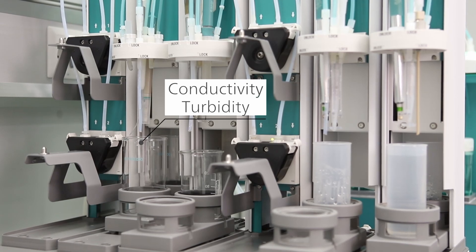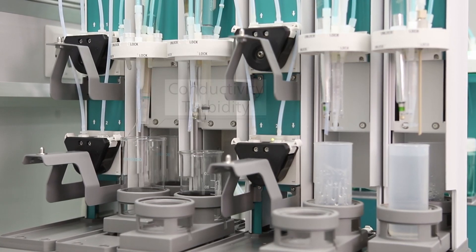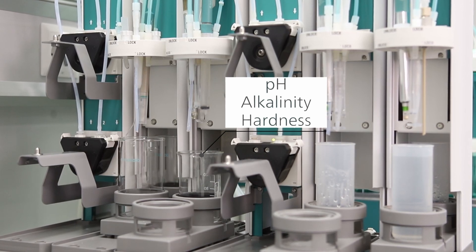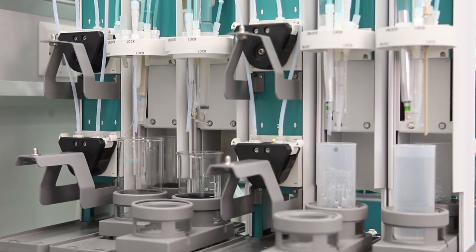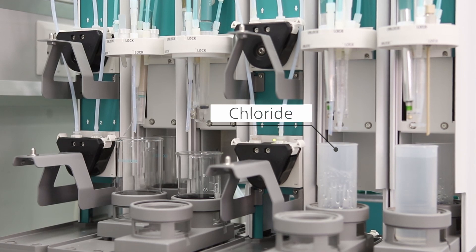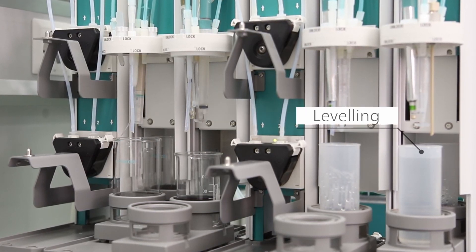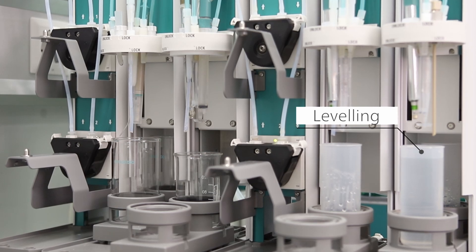The first workstation is for the conductivity and turbidity measurement. The second one is for the pH measurement as well as the determination of alkalinity and hardness, and the third one is for chloride determination. The last workstation is used separately for levelling purpose.